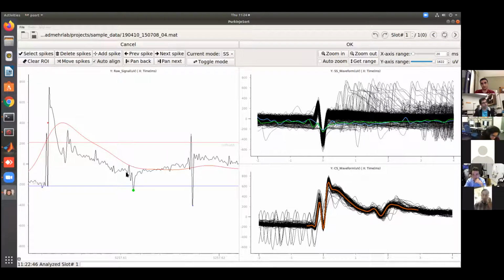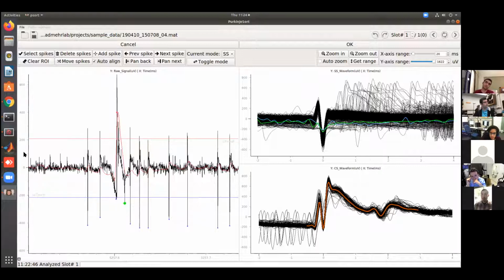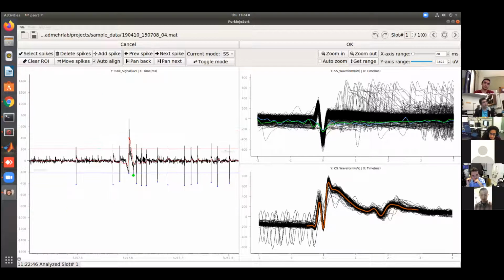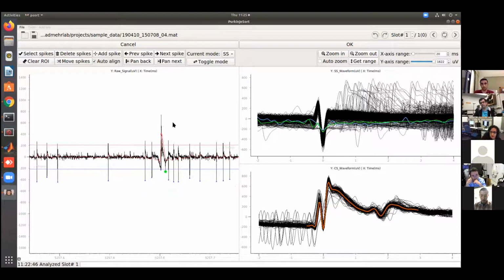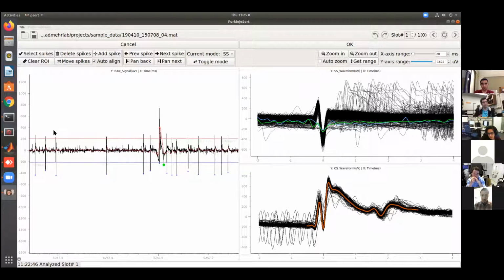or directly change things here. Oh, one thing, you can still scroll here, you can zoom in and out here. And besides zooming in and out with scrolling, there are 2 other things that always work with all plots. If you left click and drag and then move, this is panning, so you can just go over the signal. If you right click and move, this will be zooming.